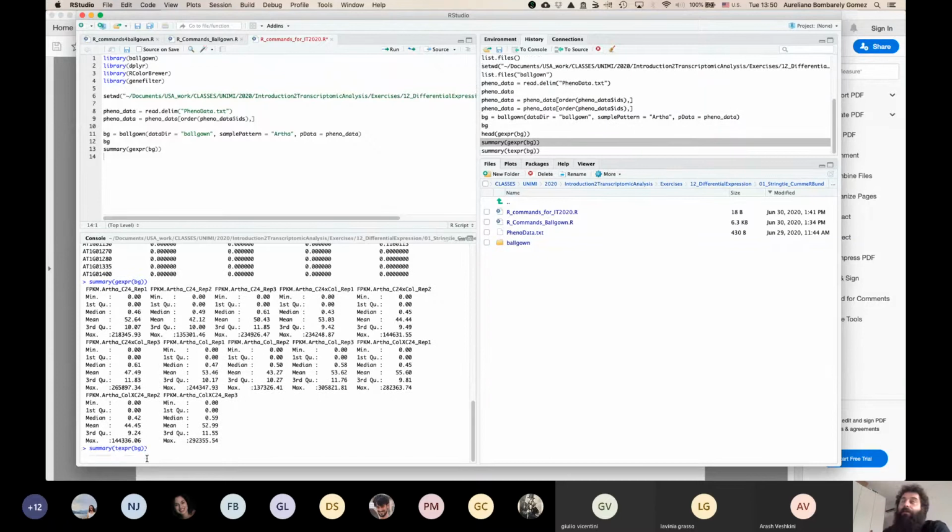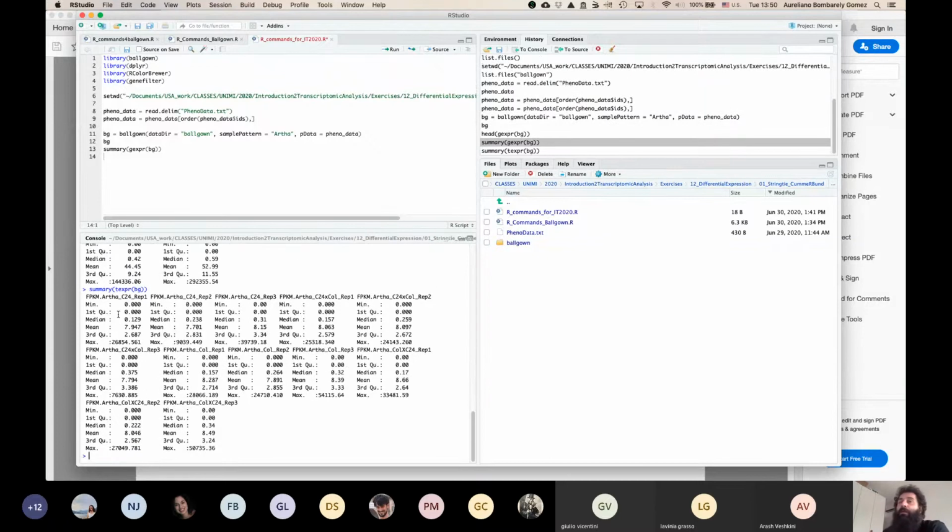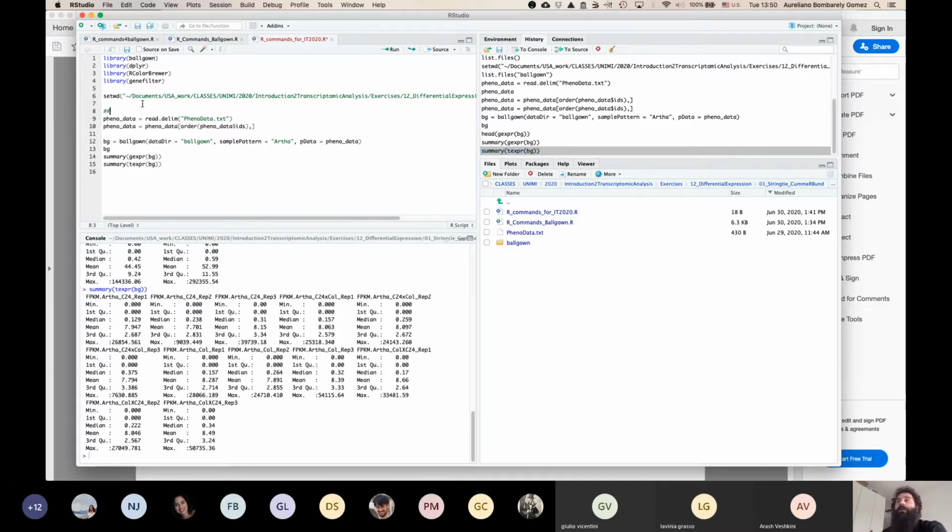That will be this function that you can see here. And again, it's more or less the same. Because we are looking at transcripts, not genes, the mean in this case is going to be lower, okay? Because it's not the sum of all of them. Okay, so that is in terms of this. Of course, if you want, I can share with you exercise 1.1.